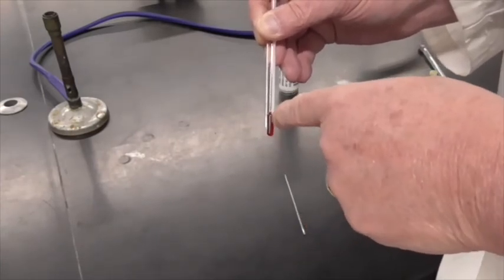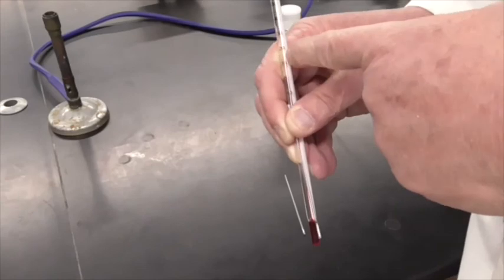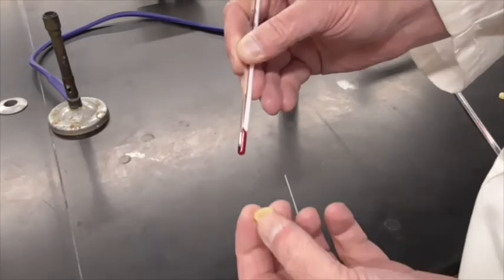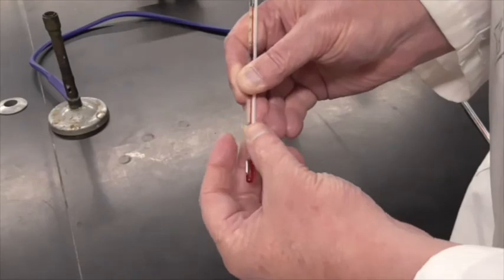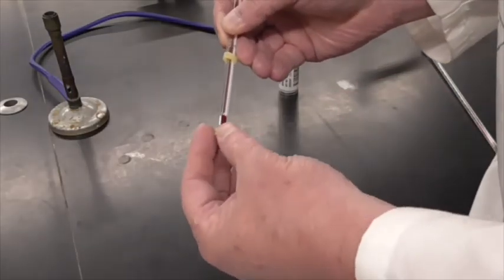As that heats up, the liquid expands and gets pushed up the tube, and wherever it ends up, that's how we read it. Okay, so what I've got is a couple small little rubber bands here. I'm just going to slide them over the thermometer and the tube. Let me do 2 of them just to make it a little bit more stable.